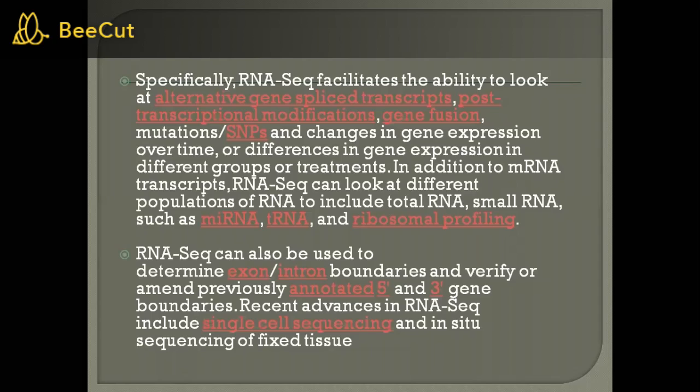So in RNA-seq, we are sequencing the mRNA molecule. In addition to mRNA, we can also take different populations of RNA, such as tRNA, small RNA, miRNA, and ribosomal profiling. These we can also analyze by using RNA-seq.